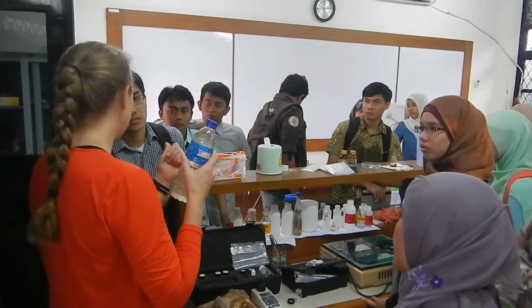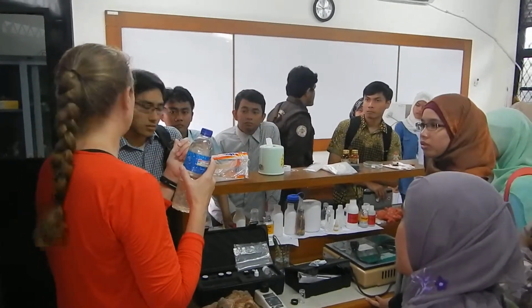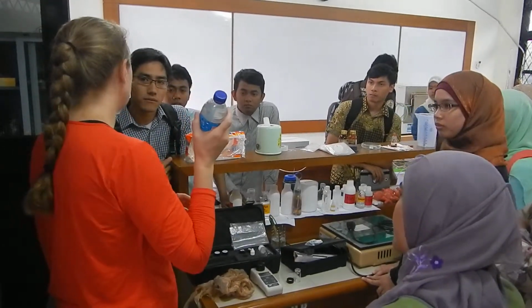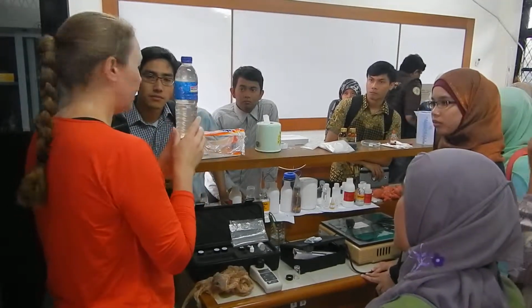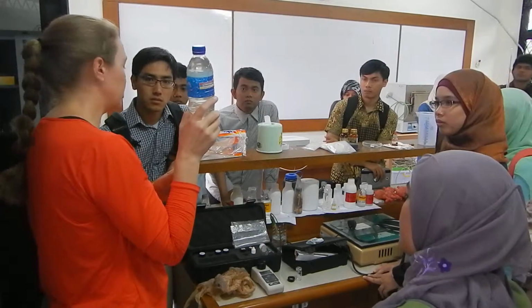If I know that and I know discharge, I can now estimate my load of sediment that goes by in the system. So I can do this much cheaper by this. So this is what I wanted to show you guys. So if you start to do something and you're looking in streams or you're trying to monitor health, like what we saw yesterday, develop this relationship for a variety of flows, then you can put out a turbidity sensor and do this much more cheaply.